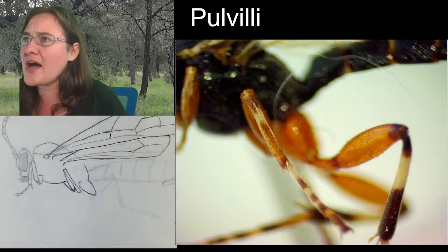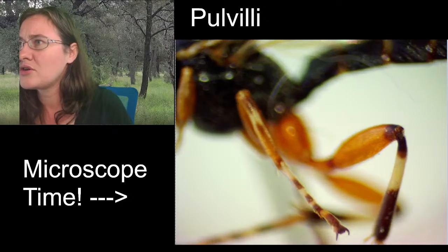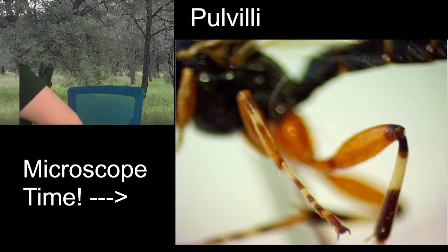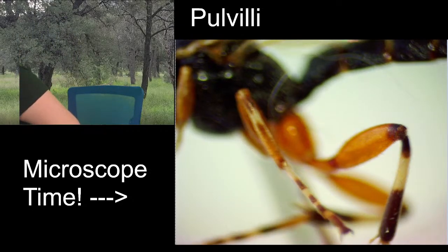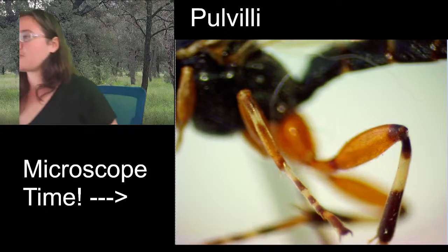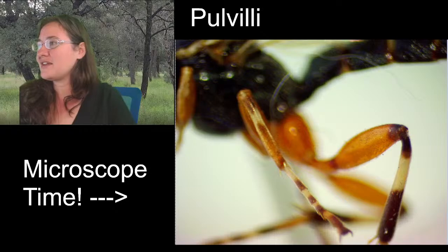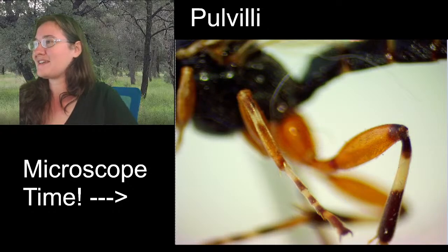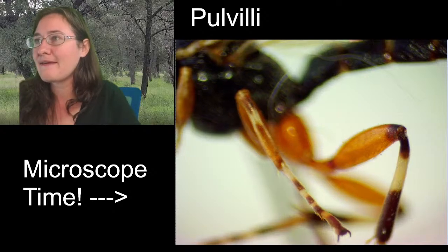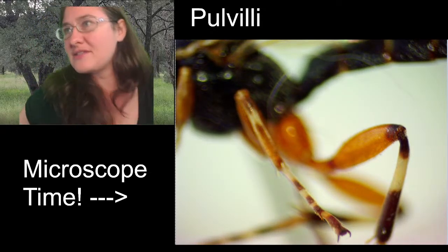All right. Let's count some tarsal segments. One, two, three, four. Whoa. How many are there? Four. It is four. That's all right. You can moderate for today. So we have four tarsal segments.